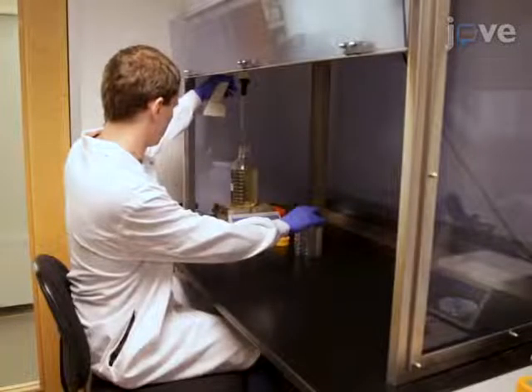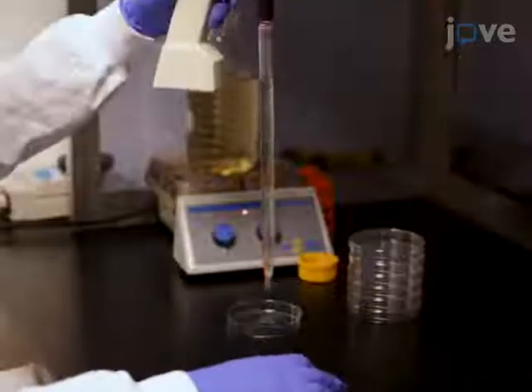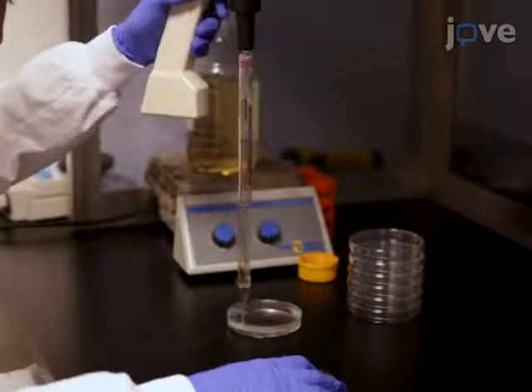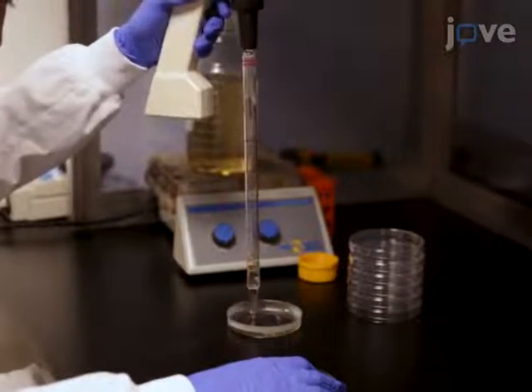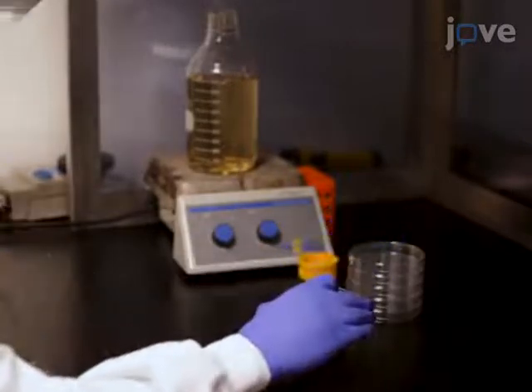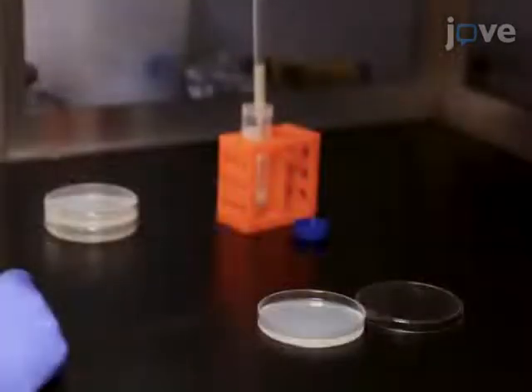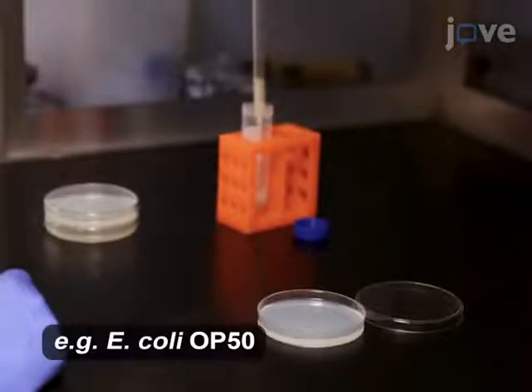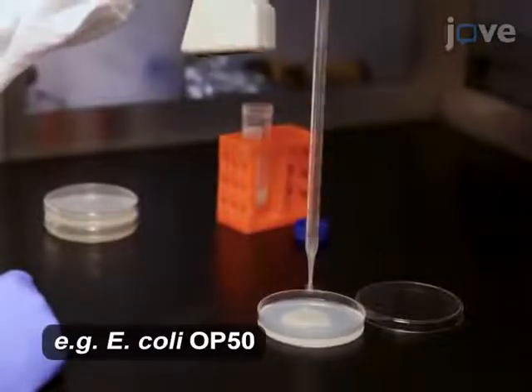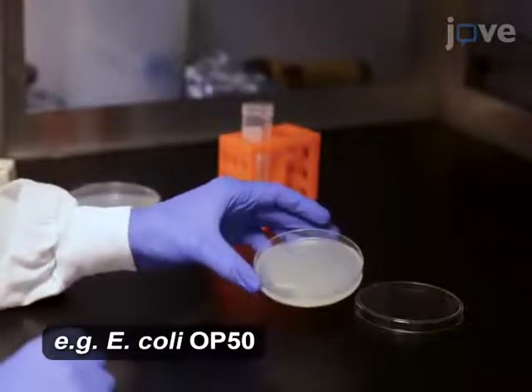To prepare mass culture plates for the production of large numbers of worms, in a laminar flow cabinet, first dispense 30 milliliters of 60 degrees Celsius nematode growth medium agar onto 10 centimeter culture plates for overnight solidification. The next morning, add 2 milliliters of concentrated E. coli onto each plate, tilting and rotating the plate to spread the bacteria completely across the plate surface.